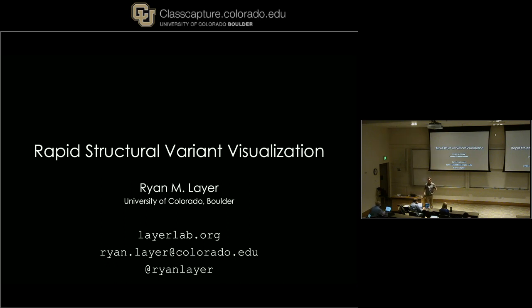I do biology by the ton. I think a lot of people get that feeling too, where for a long time people looked at individual genes and spent their entire career at that one site. But as whole genome sequencing has gotten pretty cheap, we've expanded that. We're now hunting the genome for every possible instance of our feature, and so we end up looking at many, many sites.